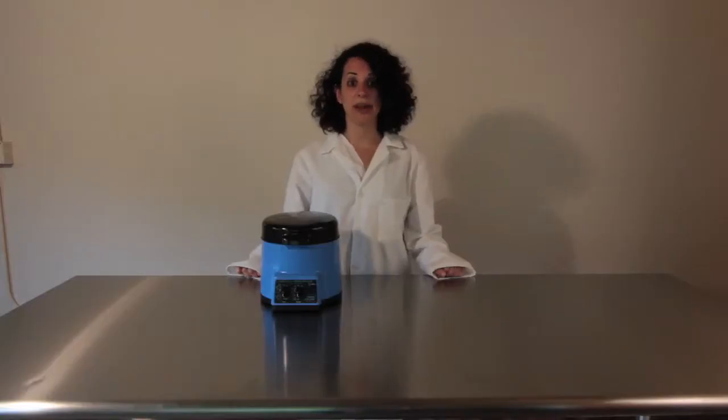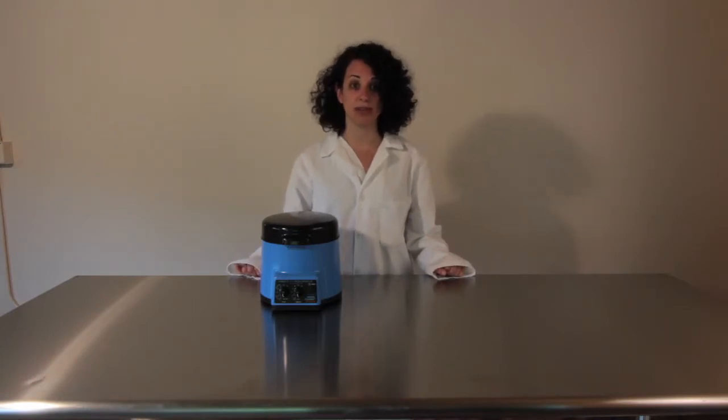TRIzol and TRIreagent can be used for the extraction of RNA, DNA, and protein. When using the bullet blender homogenizer, you can use TRIzol or TRIreagent as the homogenization buffer if that's what your application calls for. However, there are a few things you should be aware of before carrying out this procedure.